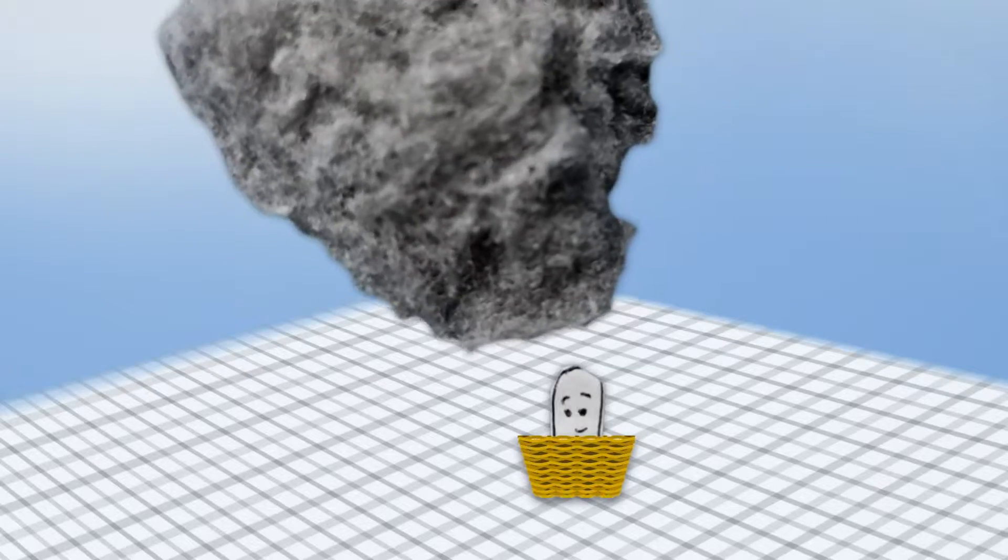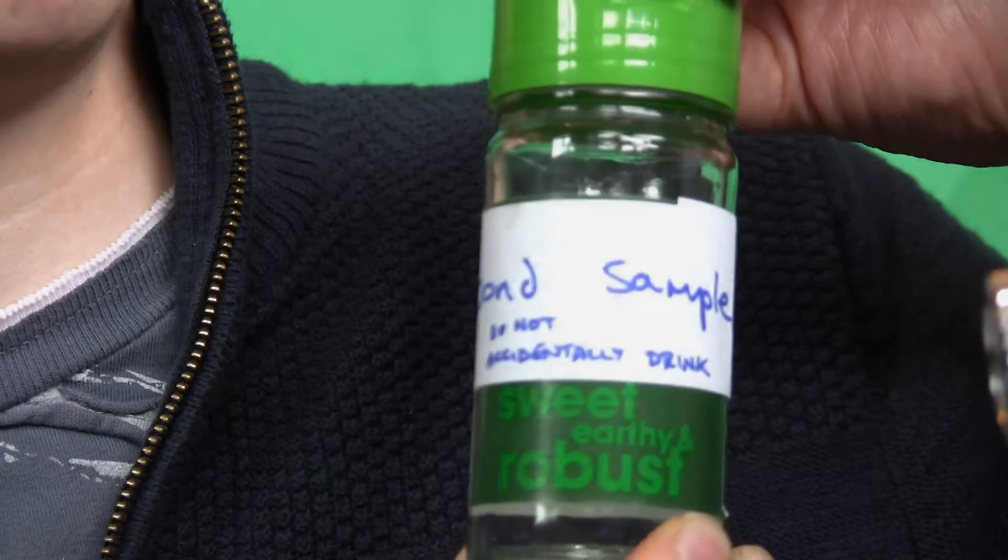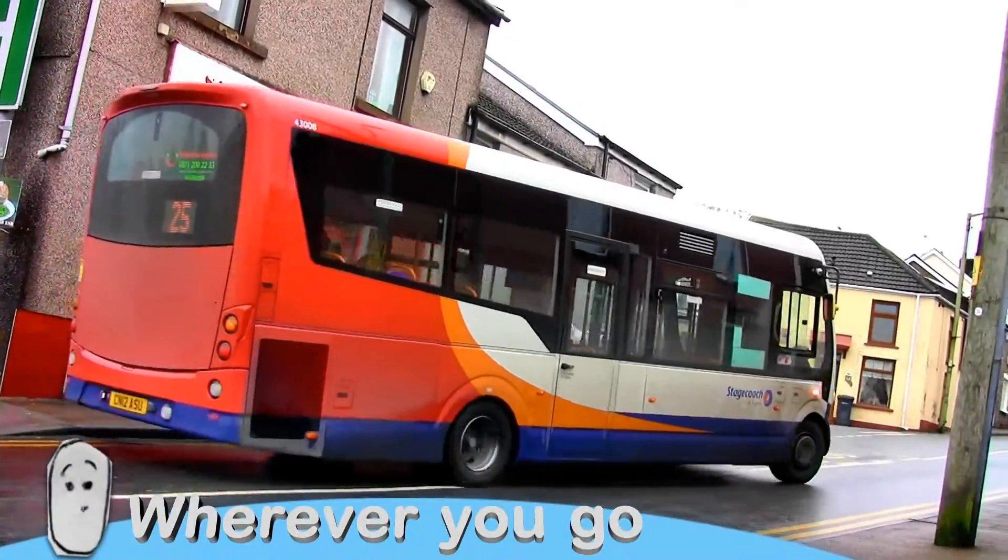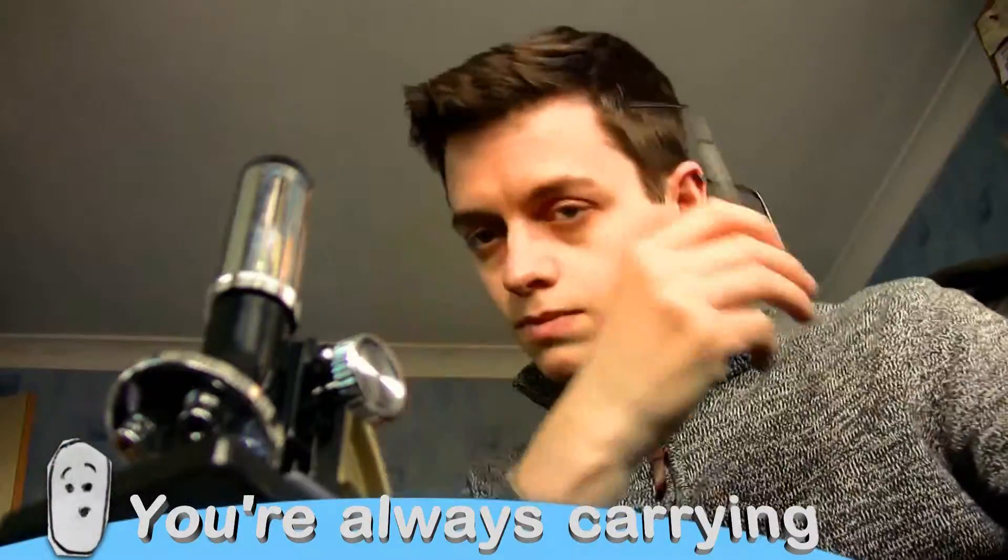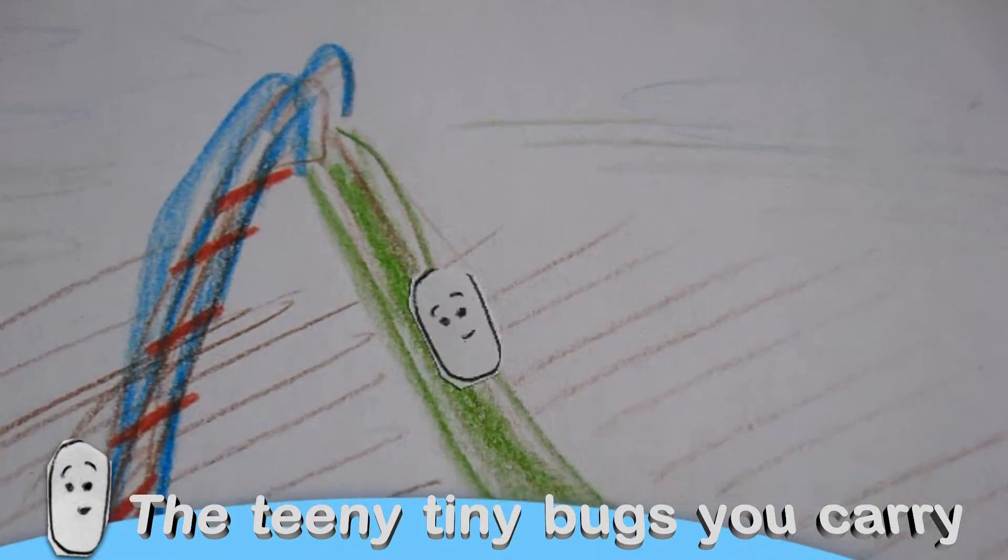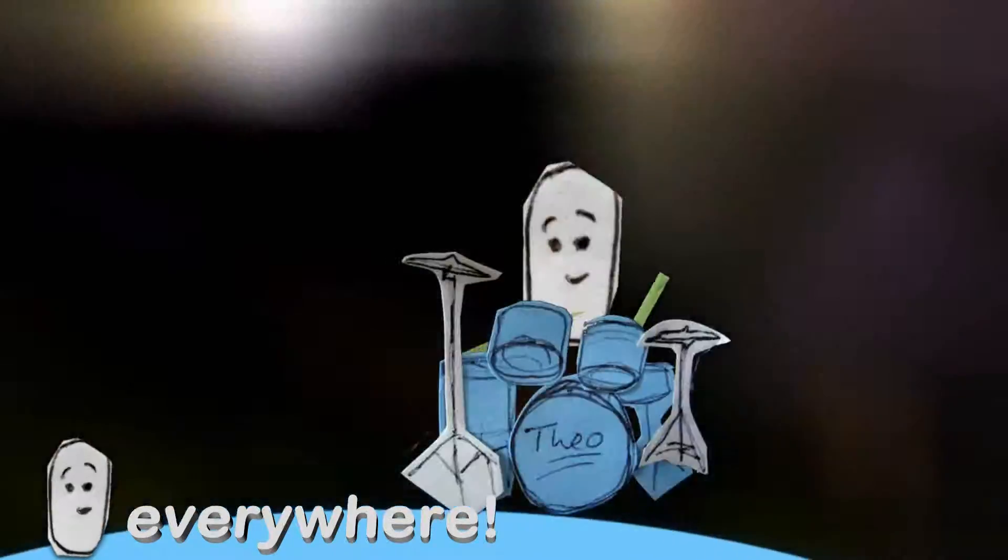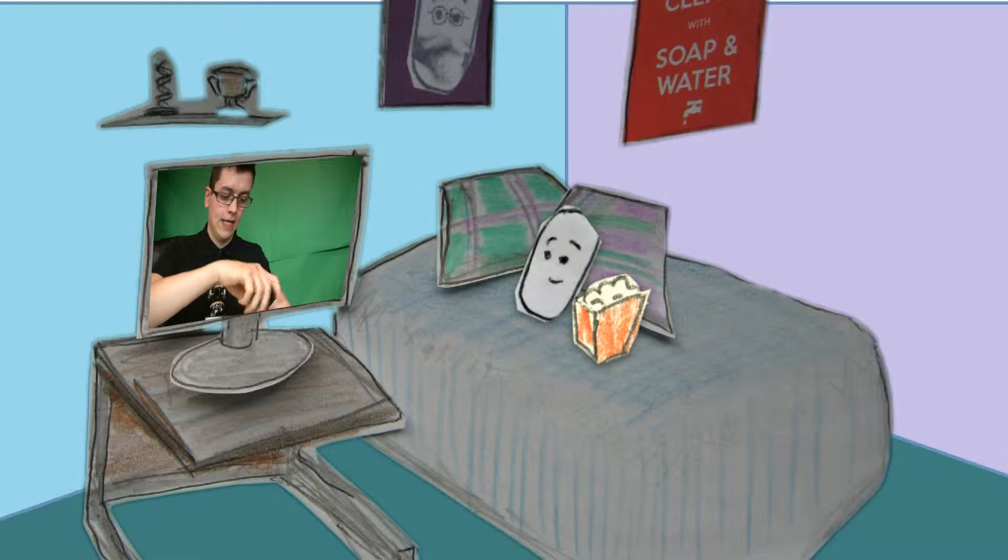There, now Theo is safely back home on his slide. Thank you. Oh, look at what I found in the pond. So that's how we left it last time. And finally I'm going to see what I found in the pond. Ah, the moment we've all been waiting for.